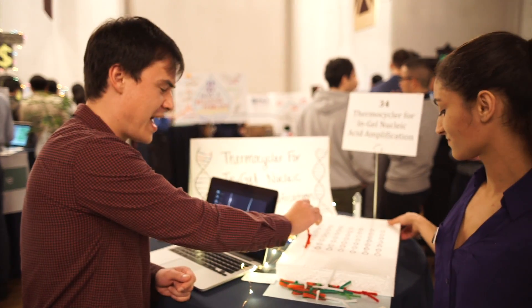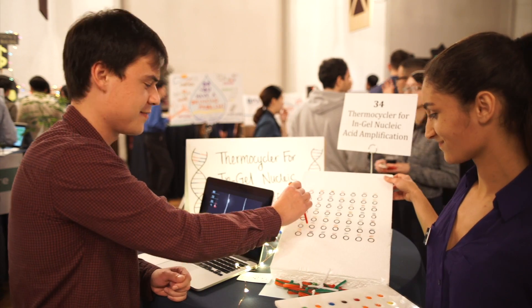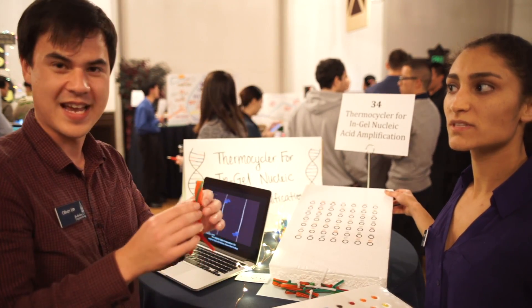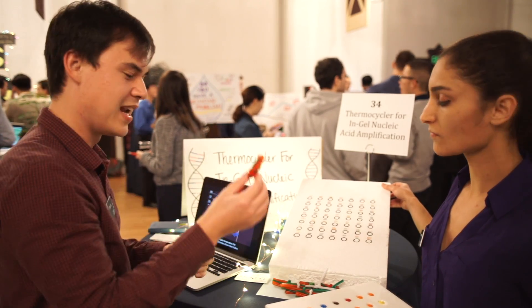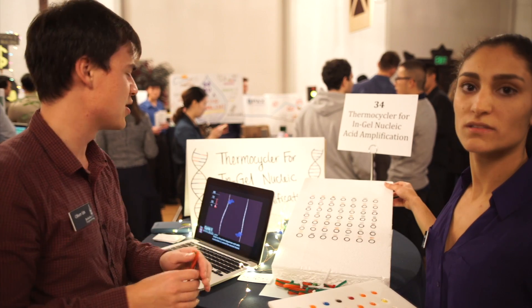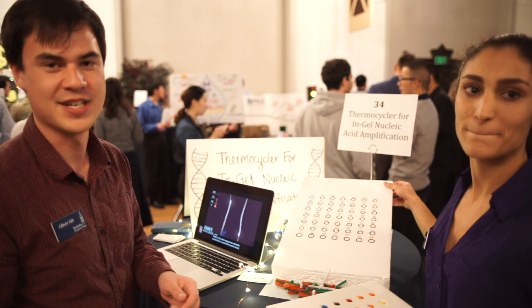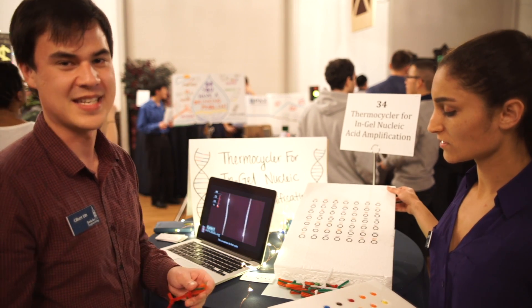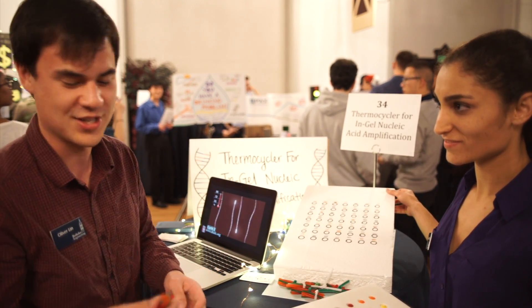These antibodies bind very tightly to the proteins of interest. Then what we do is attach short sequences of DNA to these antibodies, which then allows them to be replicated by a process called nucleic acid amplification. One of the most common methods of nucleic acid amplification is PCR — polymerase chain reaction.